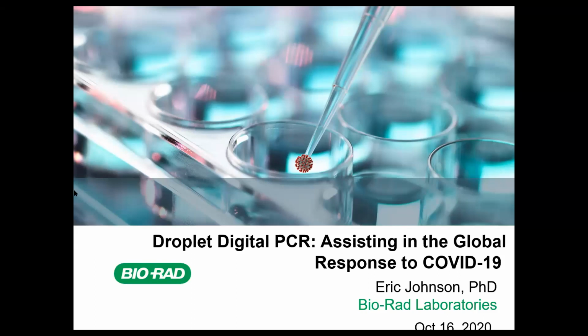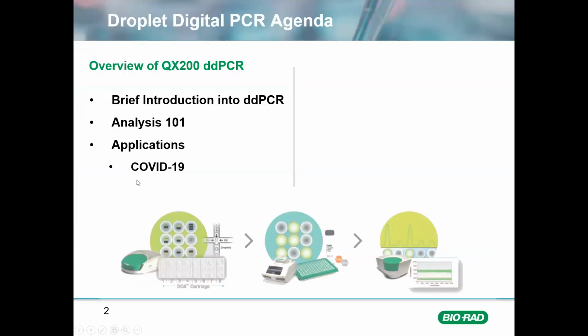So just a quick agenda for today's presentation. I'm going to very briefly introduce what is Droplet Digital PCR for those of you that were on the call last week. A lot of the same information, but I am anticipating that we're going to have some new people on the call today. So we're going to very quickly go through an introduction into what is ddPCR, a very quick overview of data analysis to set up our applications, primarily focusing on COVID-19 research.